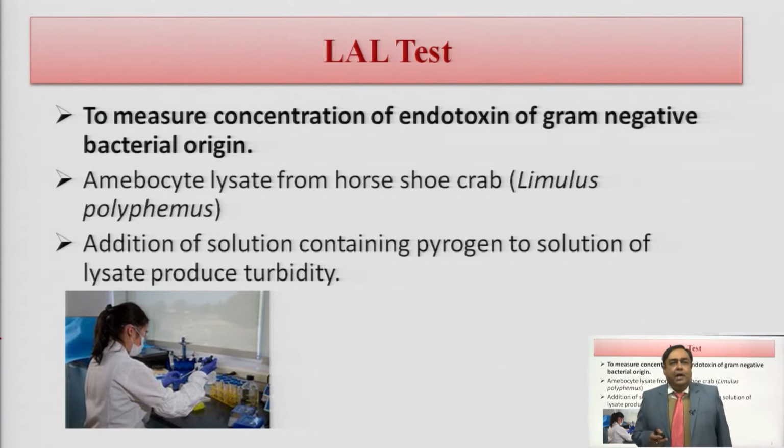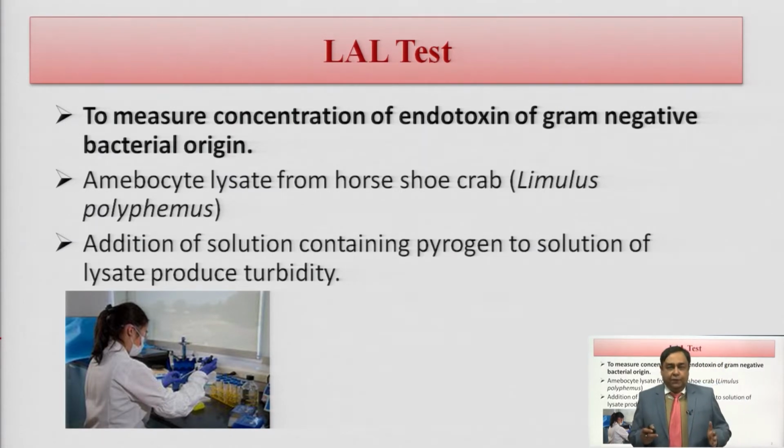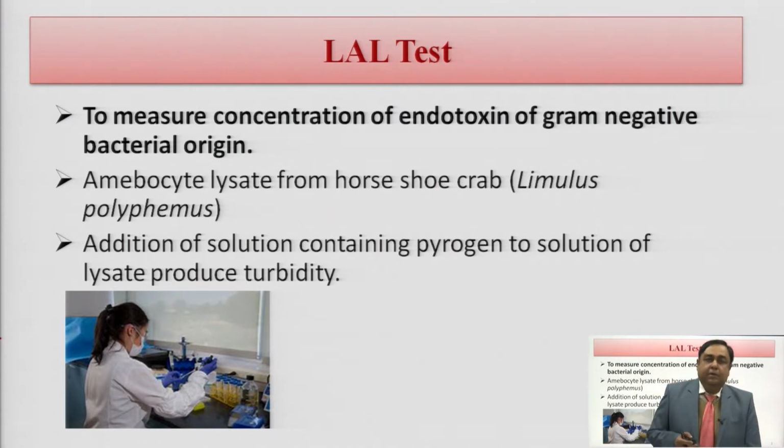But because there are a lot of restrictions on the use of animals, from the industrial perspective we have shifted, or we have explored, another method by which we determine the presence of a pyrogen in the pharmaceutical preparation. And that particular method is known as the LAL test.